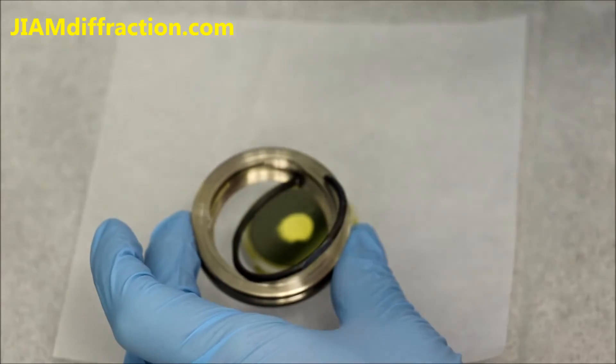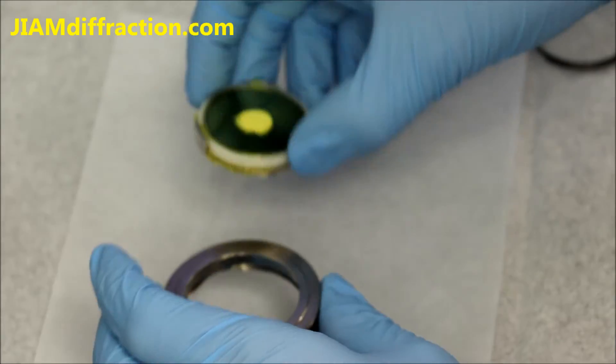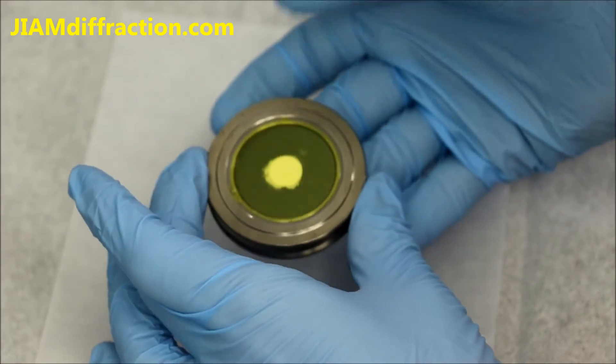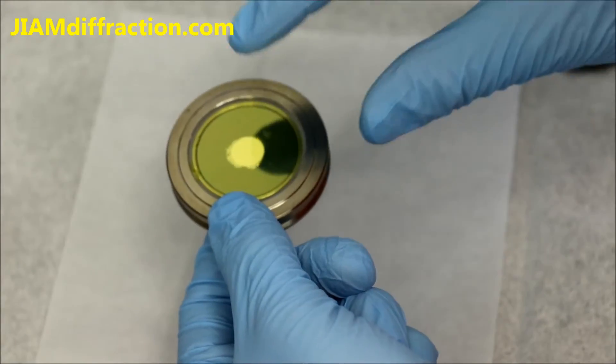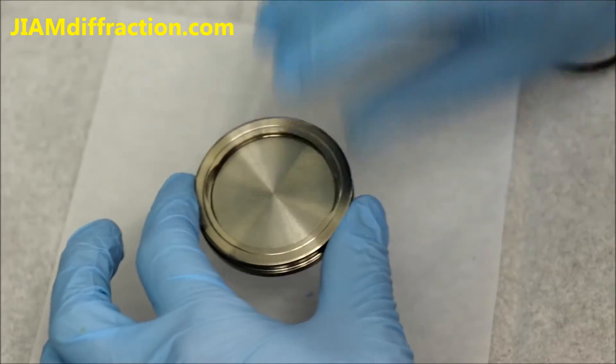And that makes it easier later once you remove it. But let's go ahead and put the sample inside. It just sits inside like that. Now the sample is covered with Kapton so it should be held pretty firmly so we can flip this over now.